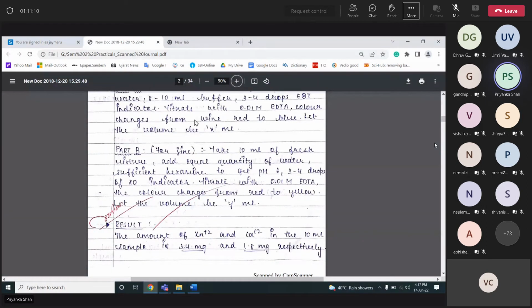And you have to perform one exclusive part for a particular metal ion. Like here, you will do it for zinc. Okay, so for zinc, you have to change some conditions. You have to use hexamine. Okay, so here once you add hexamine, what will happen?